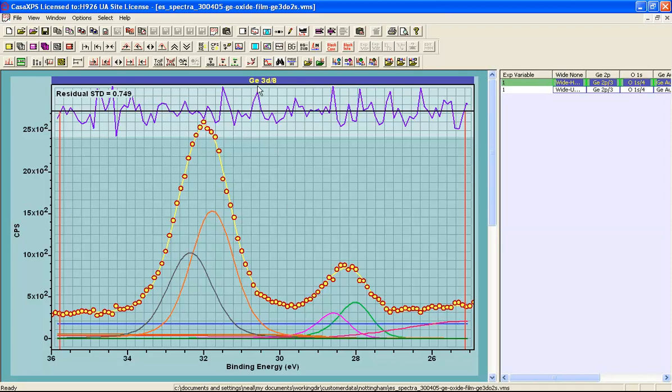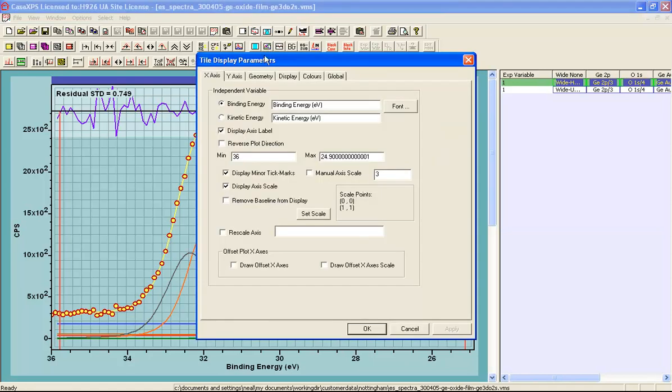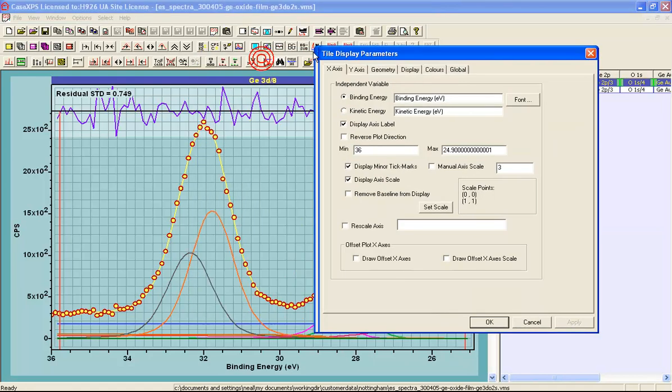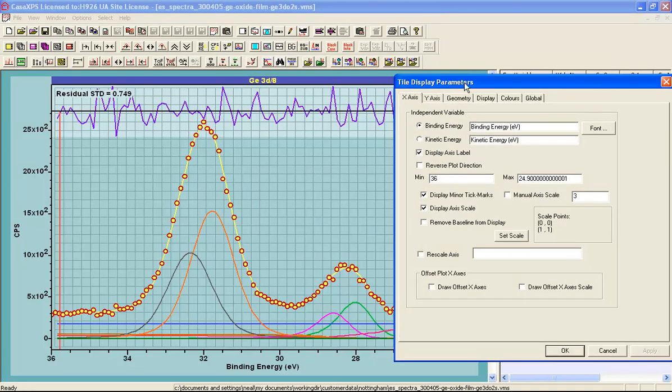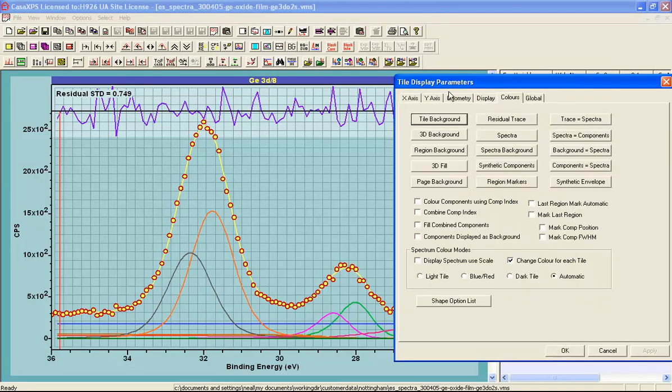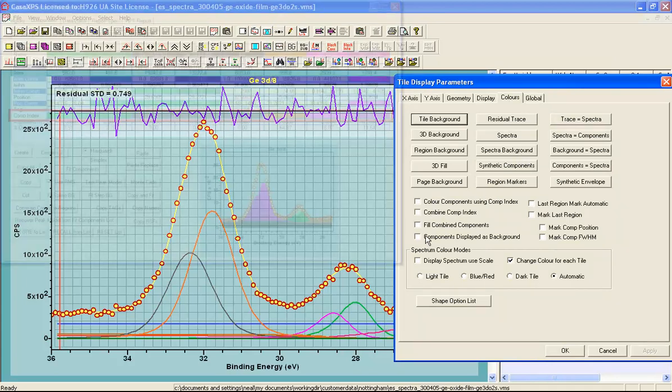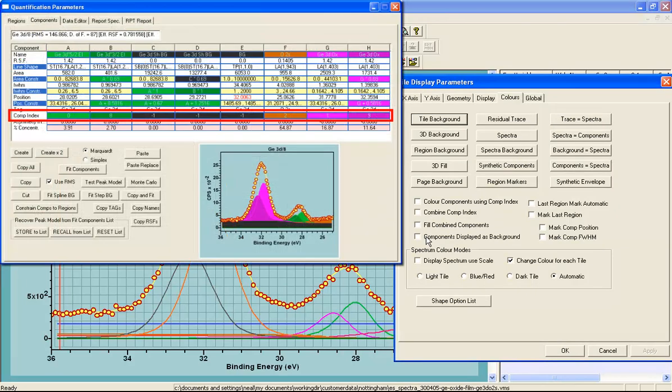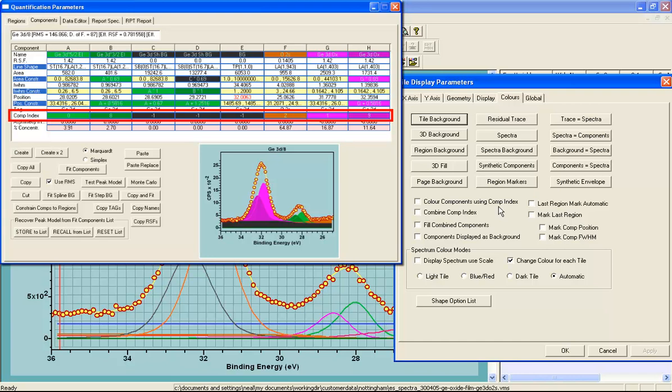In order to change the display in CASXPS, we need to use some of the options on the colors property page of the tile display parameters dialog window. These tick boxes here are the ones that will make the difference. These work on the component index, a parameter that is defined for each component within a peak model.